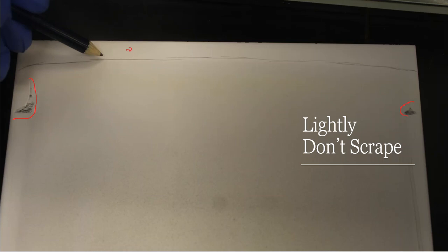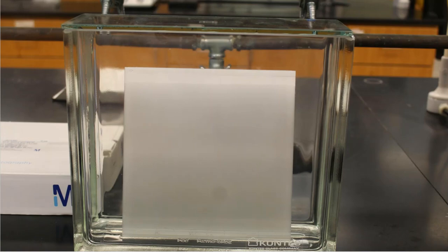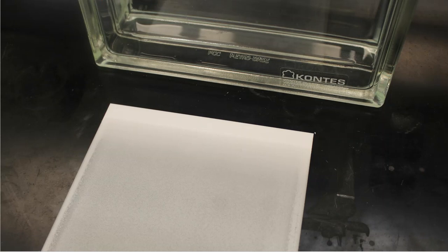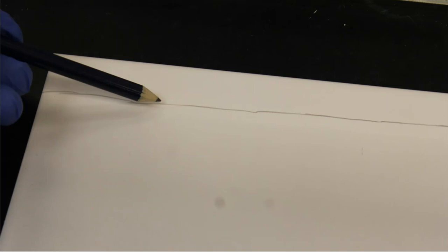So I made sure that I marked those lines up at the very top. All right, so the next plate I took out was plate number 3. That was plate number 1 that you just saw. That one was done first. Plate number 3 was the next one in line. This one was a little further away from the top, but it's toward the top enough. So I went to plate number 3, which was my 50-50 mix. I took that plate out as well. You can clearly see the wet silica versus the dry silica. Then I took a pencil and I marked that mobile phase line as well all the way across. So that way I can do my measurements a little bit later down the road when I need to.